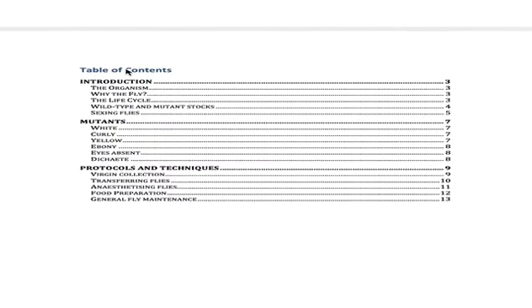In the general table of contents, you see the different components of what a fruit fly is, some of the different mutants, which is what we'll be paying attention to, and also the sex of flies. And then they have images of the different mutants to help put a face to the name of the different traits that we'll be talking about in our own Punnett squares. And then we have some protocols.